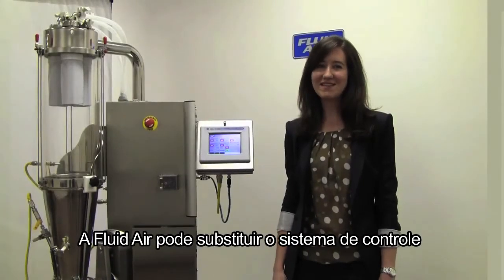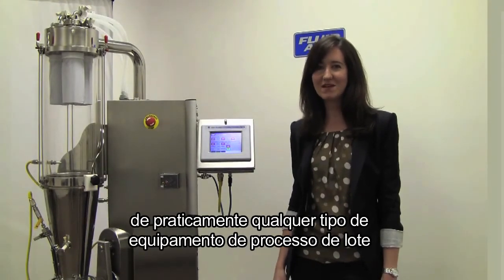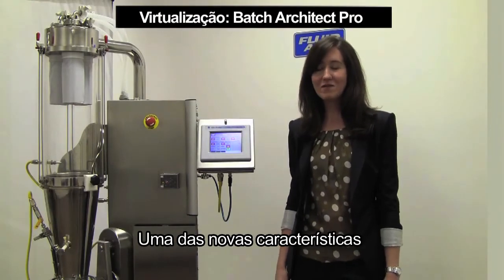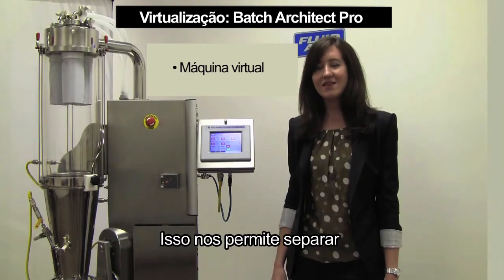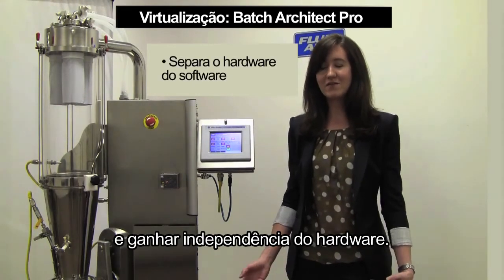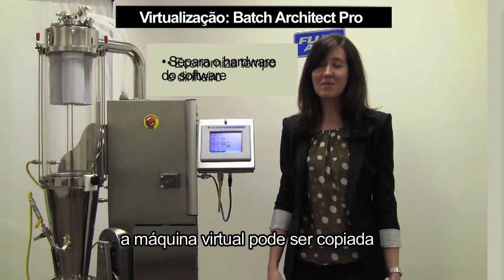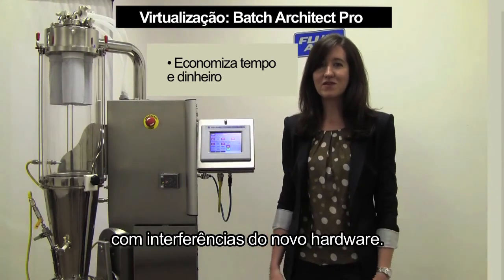Fluid Air can replace the control system on nearly any type of batch process equipment with either our Batch Architect or Batch Architect Pro system. One of the new features of our Batch Architect Pro is the utilization of a virtual machine. This allows us to separate the software from the hardware and gain independence from the hardware. In the event of a disaster, that virtual machine can then be copied over to a new computer without worrying about interferences with the new hardware.